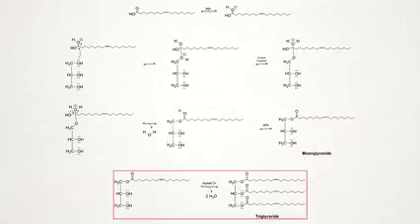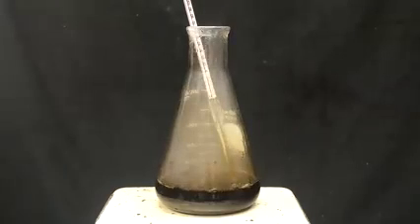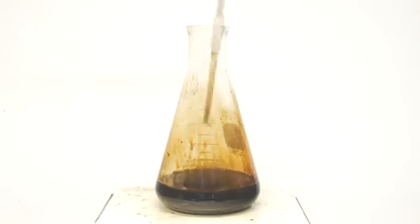So I finally reach 195°C, and I turn on my timer for 100 minutes. The solution is giving off a lot of white vapor, and at first I thought it was water, but I think it's something much worse than that. I don't really have a way to completely confirm this, but I think it's a combination of smoking fatty acids as well as acrolein from the breakdown of glycerol. So not only is it irritating to both the lungs and the eyes, but the smoking fatty acids are technically a fire hazard. Anyway, 100 minutes later, the reaction should be done.